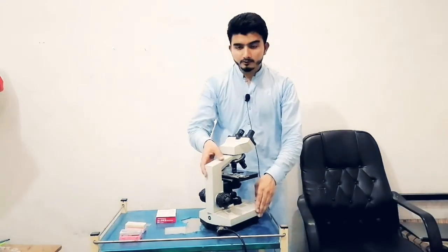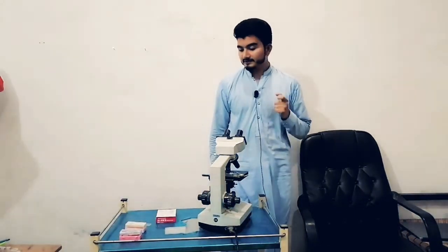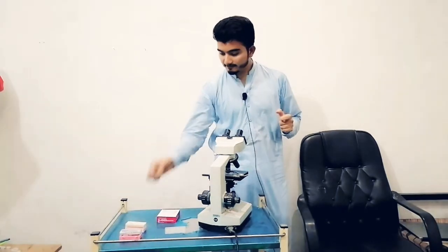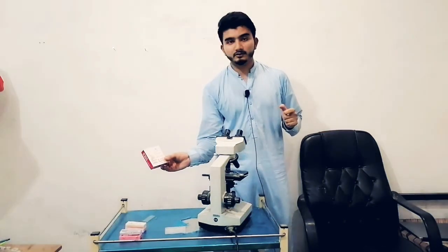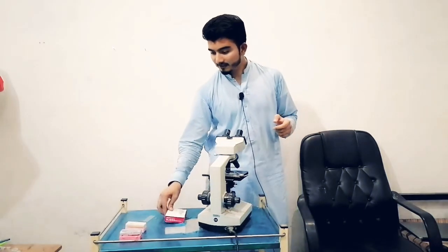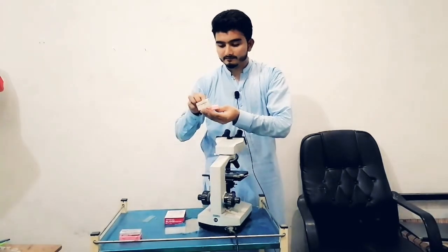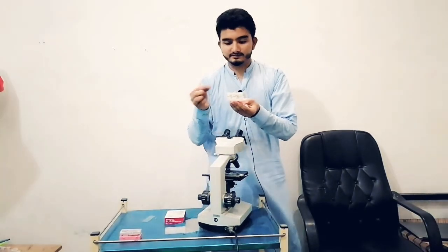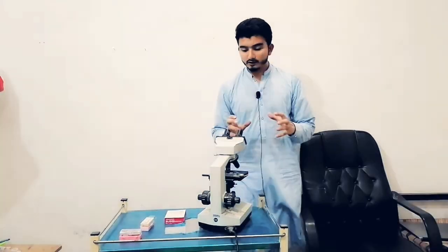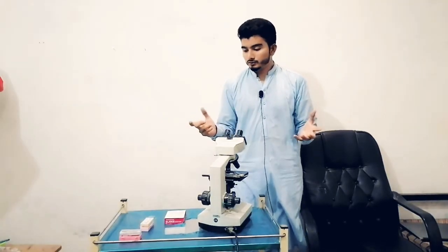So how will we work on this microscope? It's easy. We need some things very importantly. This is a slide, and I have a slide box. It's quite easy, you can take it from the market. Also we have the box of cover slips. It contains cover slips, the very small square glass. These are used when you are examining something. If you are magnifying something on the microscope, you will need these things.